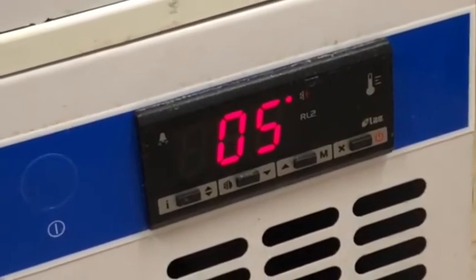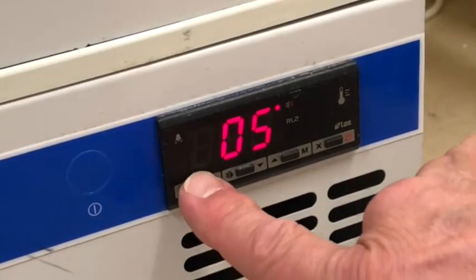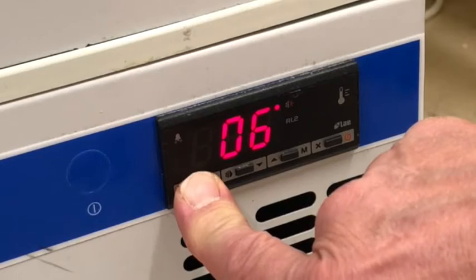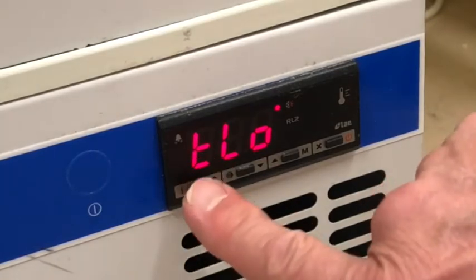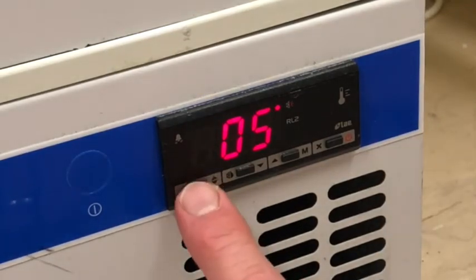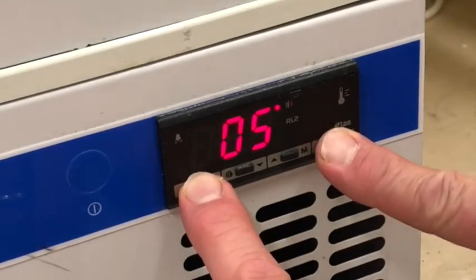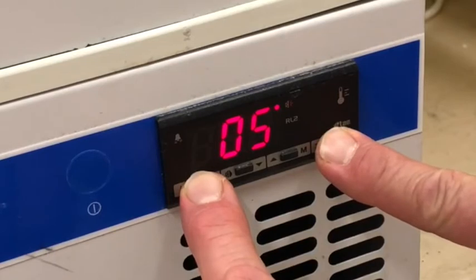The older LEC fridges in the Trust have one of two different control panels. For the first type, press the I button. THI will appear on the display. Press and hold this button again to display the maximum temperature and record the number. Release the button and TLO will appear. Press and hold this button again to display the minimum temperature and record the number. Do not insert a decimal point if this is not illuminated in the display — it's normal to have a zero illuminated in front of the number. To reset the temperatures, press the I button, then press and hold the I again and press the X button too. Release both buttons, then press the I button and press the X button too. You've now reset the maximum and minimum recorded temperatures.